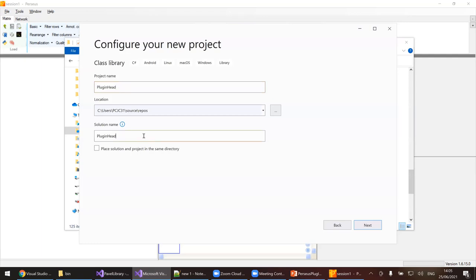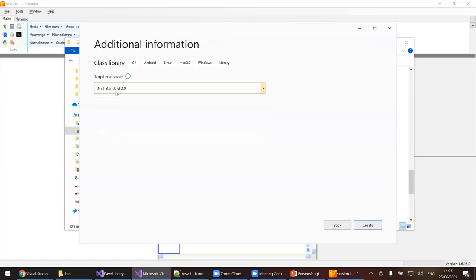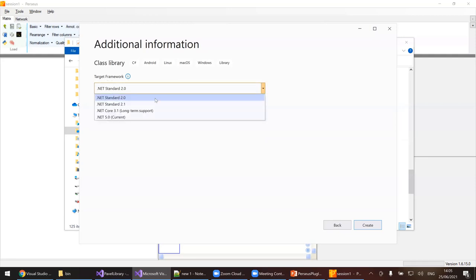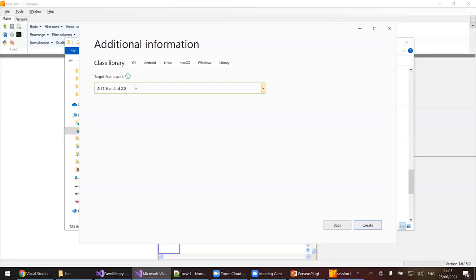So we'll call the project 'PluginHead', and the solution 'PerseustTutorial'. One really important thing is the target framework. There are many options, but currently we support .NET Standard 2.0, and I highly recommend targeting .NET Standard 2.0. Yesterday I tried 2.1 and it crashed, so don't repeat that mistake.